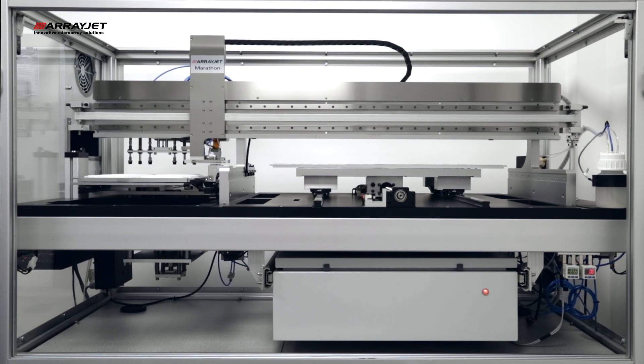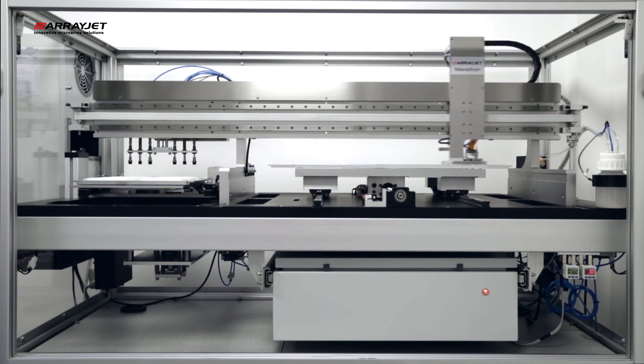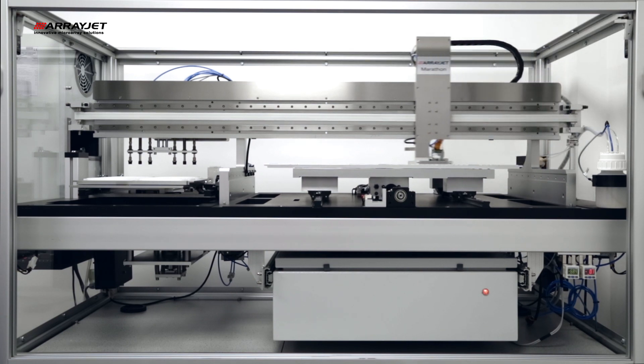On-the-fly printing is exceptionally quick, allowing for example a 10,000 feature microarray to be printed to 100 slides in under 90 minutes. Multiple subarrays may be printed per slide, with the printhead automatically adapting its print pattern to meet user specification.